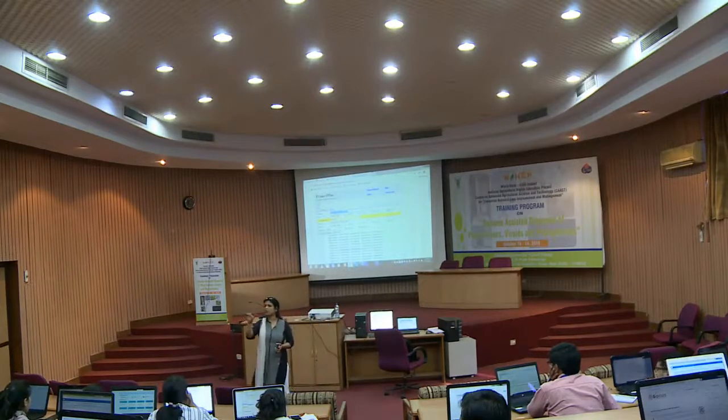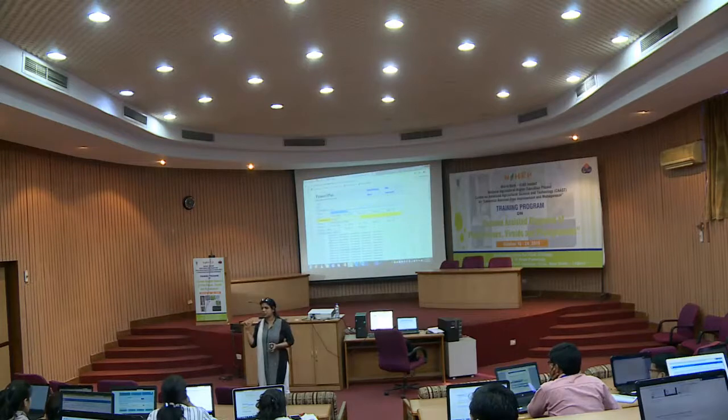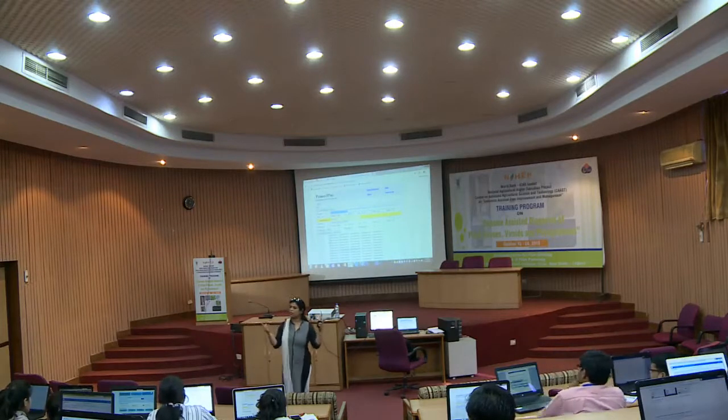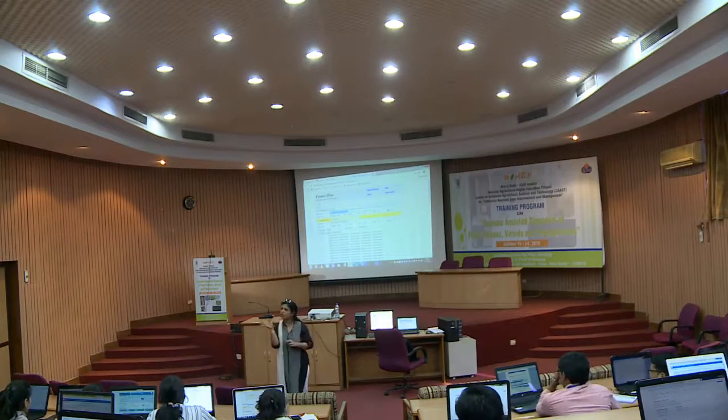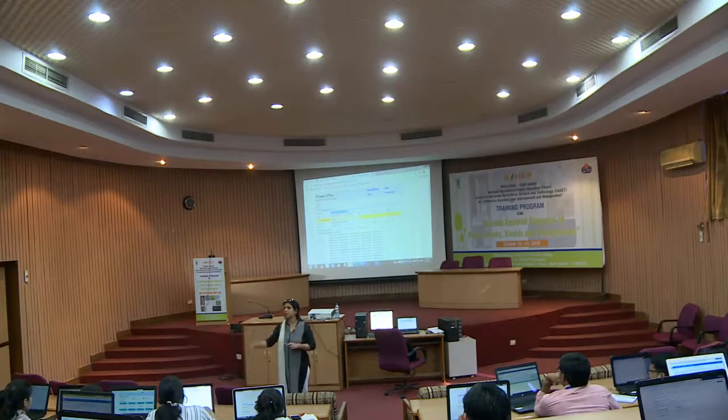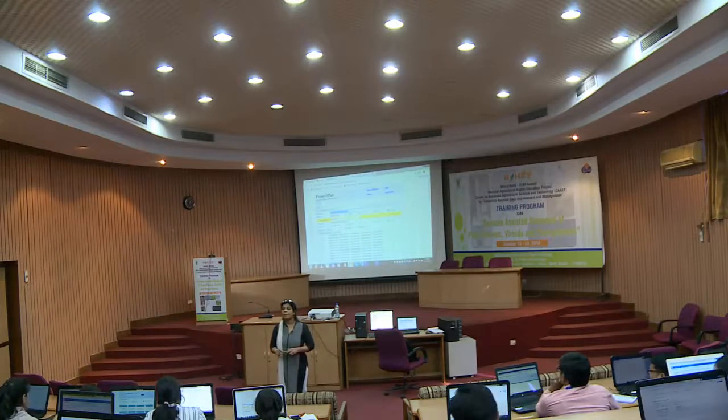Because the sequence you are already having with you, right. Let us suppose you have around 1 kb or 1.5 kb of sequence. Forward and reverse primers you have already designed to amplify that region. Now, some internal primer you can design in any orientation, so that the company people can use that and sequence that region. So that is done manually, or no, from this software only you can use.